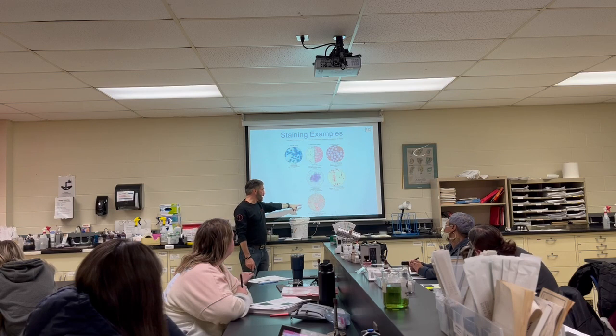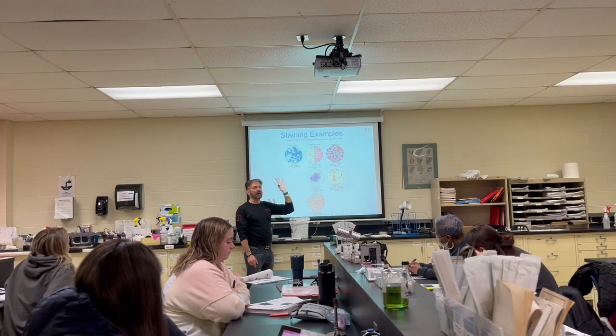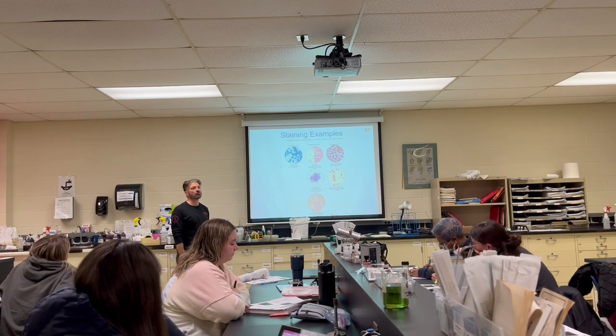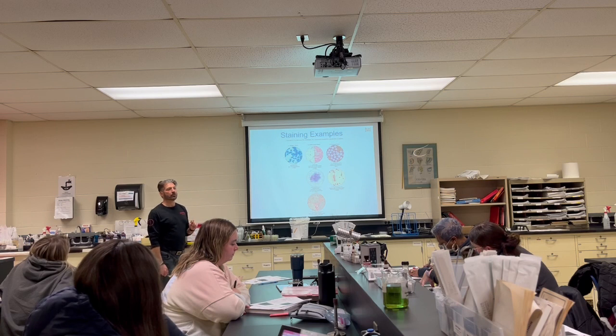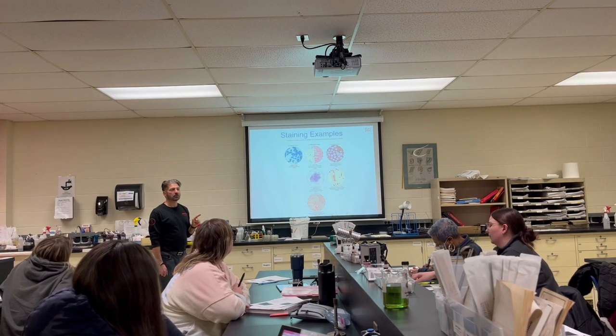And there's a spore stain. So these are hard. They usually don't work out. But you'll see little dots. Now I know that bacteria is a spore former. I know it's gonna be really hard to kill. Does anybody remember the only way I can kill something with a spore? Autoclave, and what was the other one? Tyndallization?